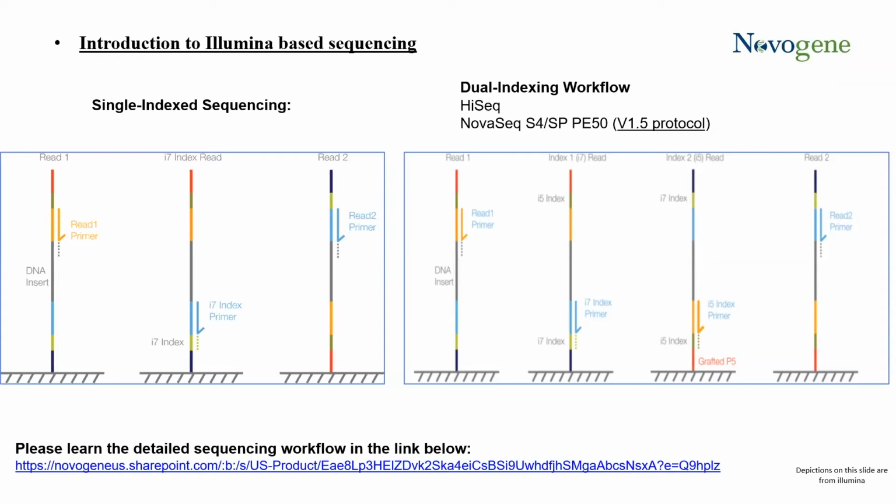If you have many, many samples and you are trying to cut your costs or potentially accommodate all your samples within one kit, then the ability to demultiplex should be greater here because you need to be able to separate the individual molecules themselves. So starting off with the single indexed sequencing approach, both approaches are very similar.